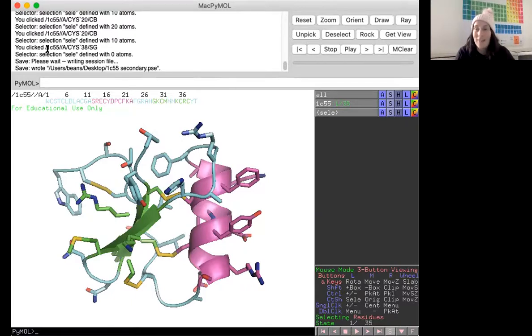I hope this PyMOL instructional video helps you and kind of inspires you and gets you excited to start investigating at the microscopic level, at the atomic level almost, what these different structures are and the amino acids that they're made of.